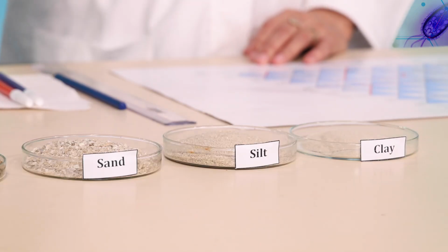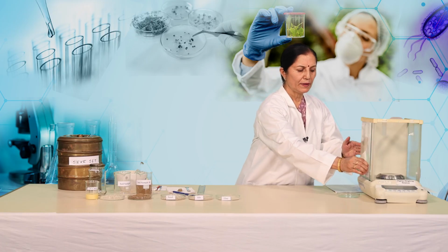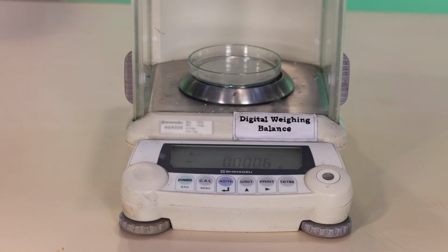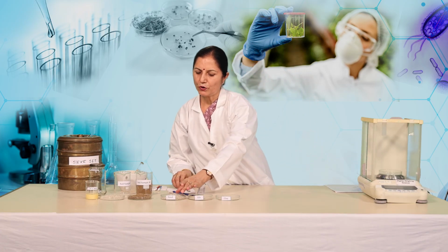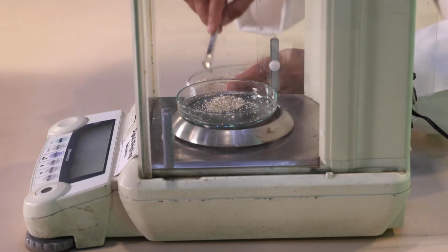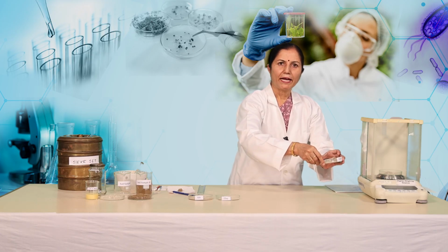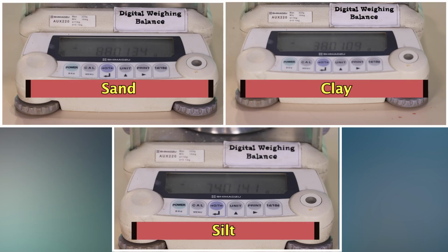Collect 3 different soil fractions in 3 different petri dishes and weigh them. In order to weigh them, we need to take the weight of the empty petri dish first of all. Tare it. Transfer one of the soil fractions, for example sand, into this petri dish and take the weight. Similarly, we can transfer the entire sand into this petri dish, calculate the percentage of each fraction and tabulate the results in the table.